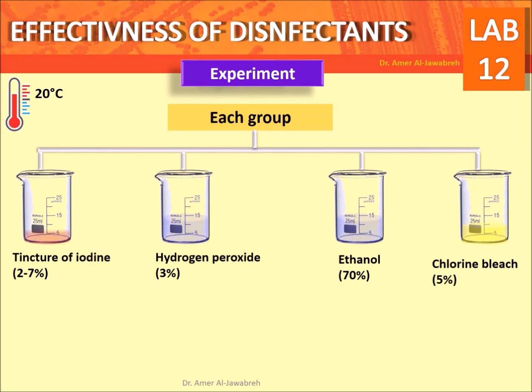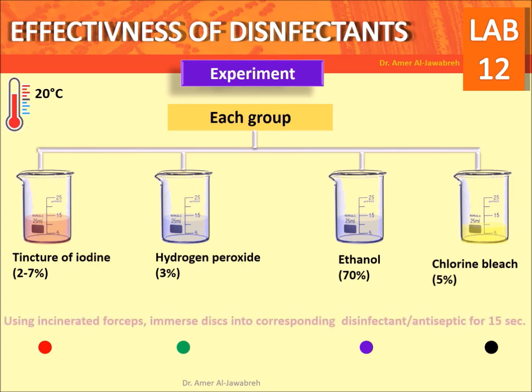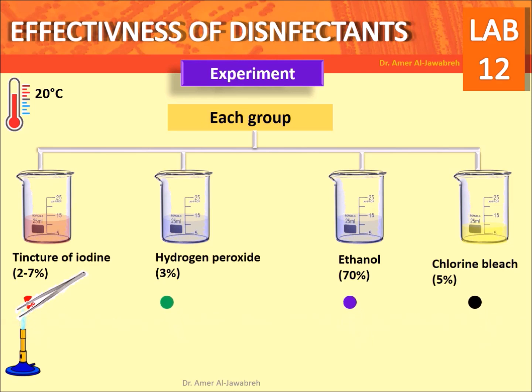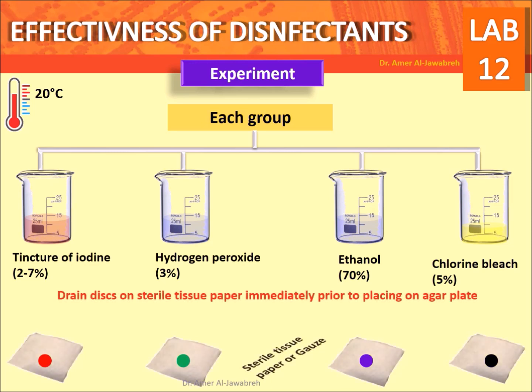For each group, provide 25 ml beakers with 10 ml of the tested disinfectants or antiseptics. Puncture disks from different colored papers, using the color as a label code. Using incinerated forceps, immerse each disk into the corresponding disinfectant or antiseptic for 15 seconds, then drain on tissue paper immediately prior to placing on the agar plate.